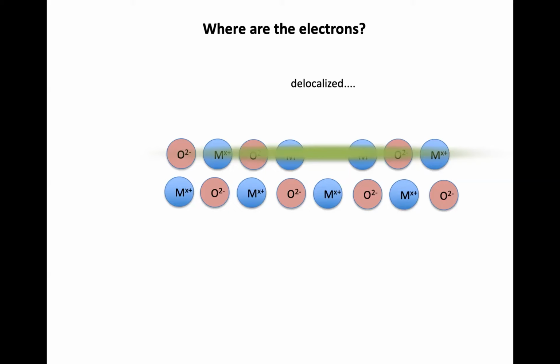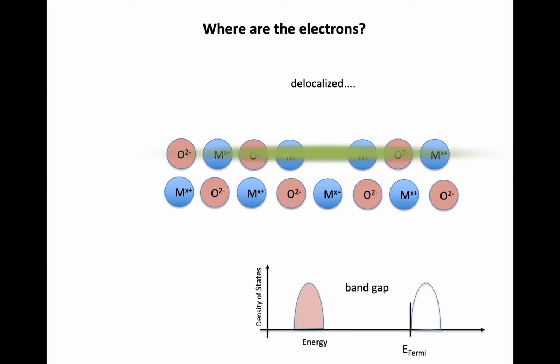You can tell that from the electronic structure, because what would happen is you can think of this empty conduction band moving down a little bit just below the Fermi level, and then you have a very sharp density of states right here at the Fermi level. Okay, and with the state-of-the-art microscope, you can look not only at empty states like I showed you before, but at filled states, and you can actually see where the electrons are.